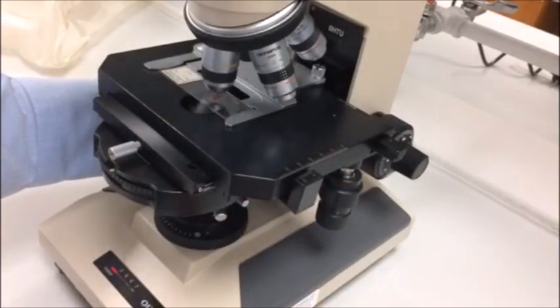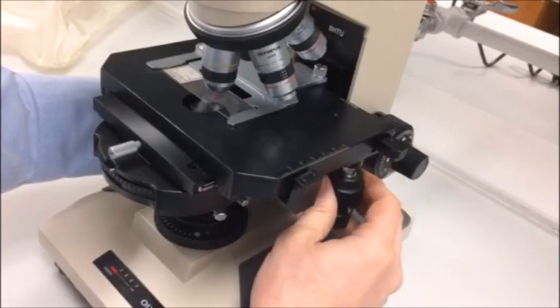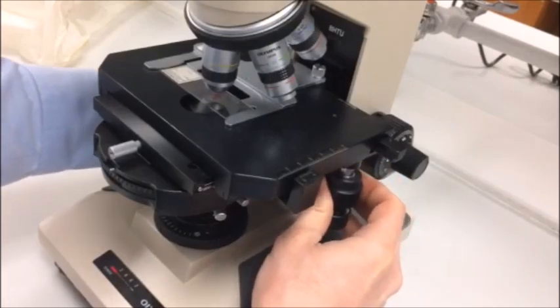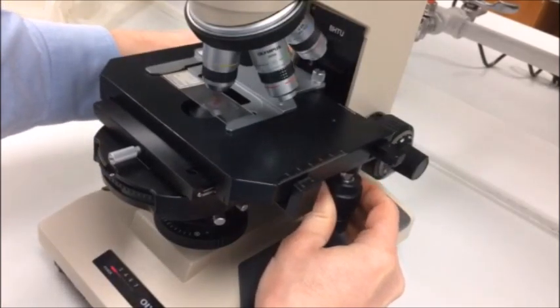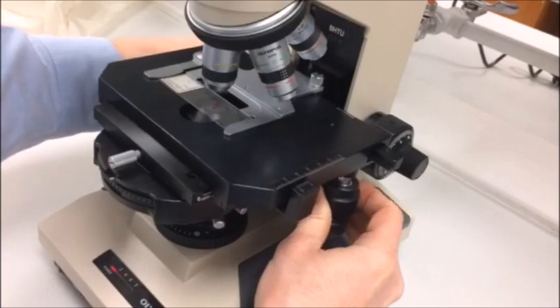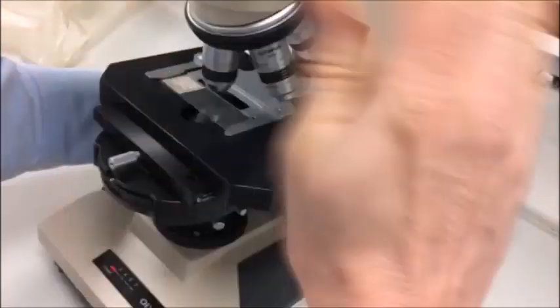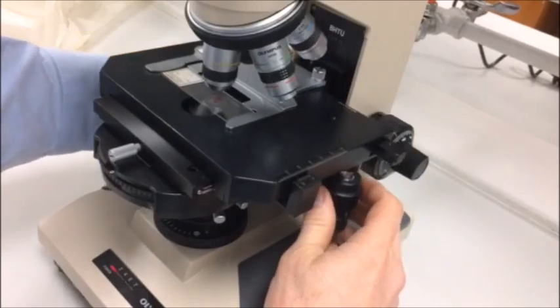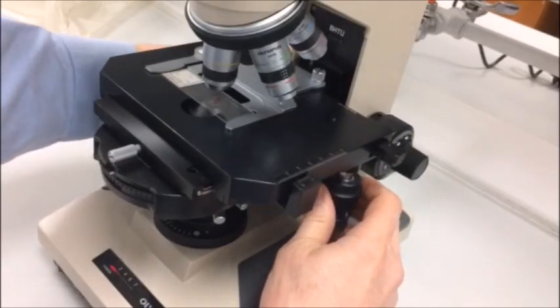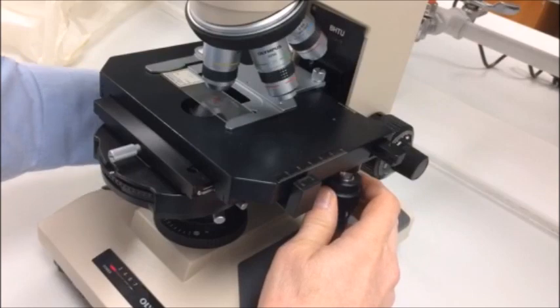And it's hard to tell, is that the thing I'm supposed to be seeing or is that something else? If you wiggle the mechanical stage back and forth as you gradually turn the stage down, then when the object you're looking at starts to get in focus, you see it go moving back and forth in the screen. And that allows you to know that, hey, I'm getting pretty close to having the object in focus.